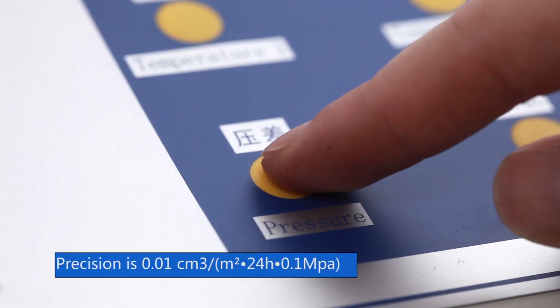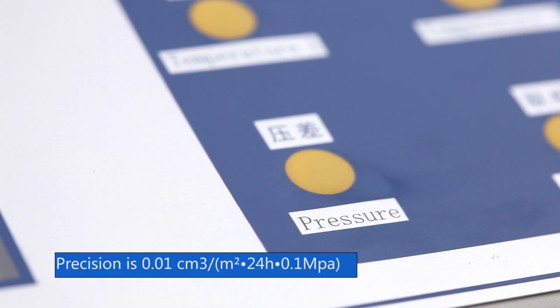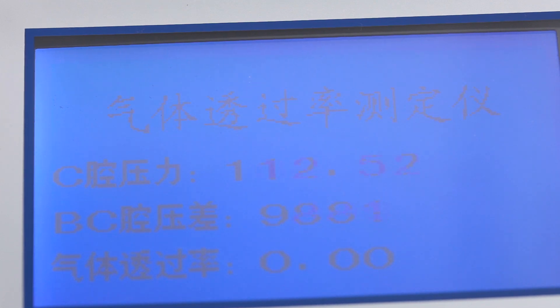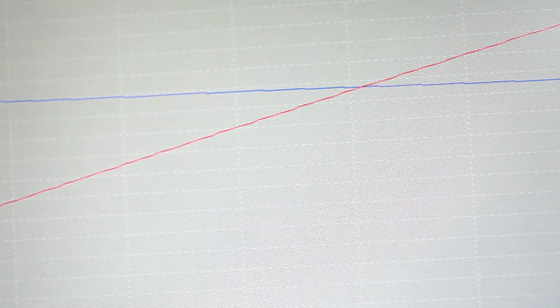Precision is positive or negative 0.01 Celsius degree. Real-time display data and curves of transmission rate, pressure, pressure difference, and temperature. It's easy for users to track the running status.